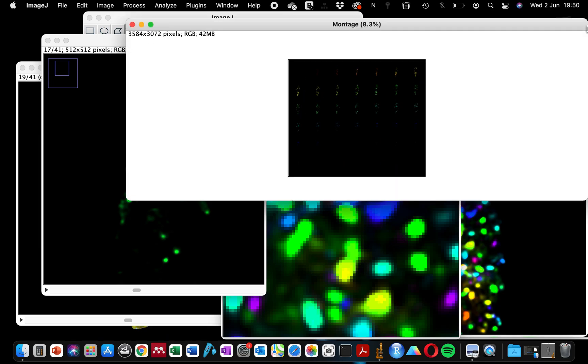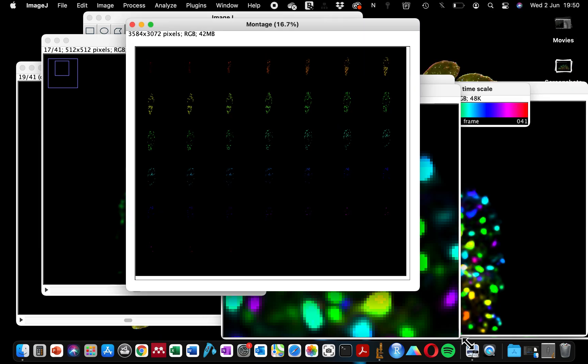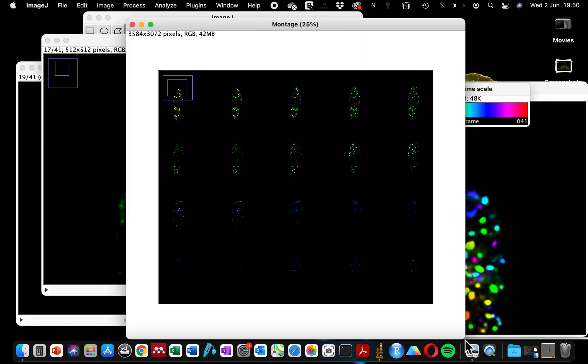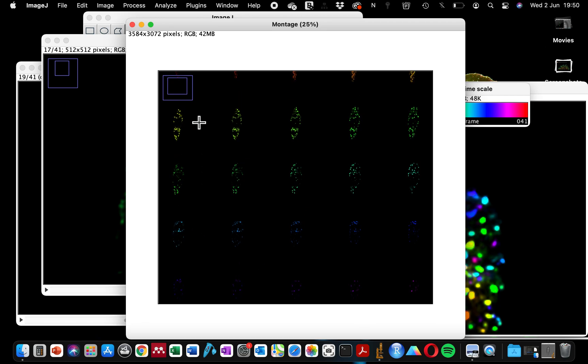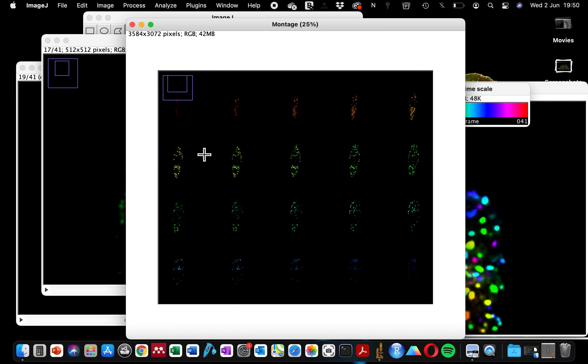It will split them into stacks, make montage. This will split the image into the different color depths that has generated. You can see that these different images are at different Z-stack positions and it has generated the colors from the darkest red to the lightest orange to yellow.